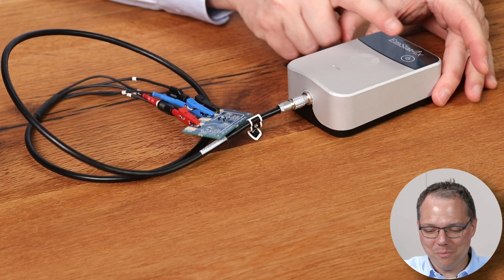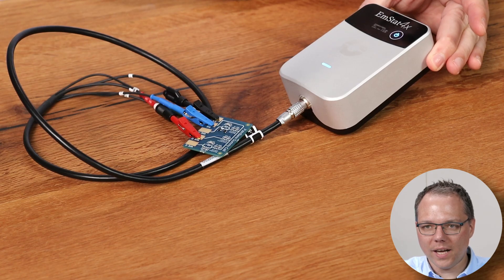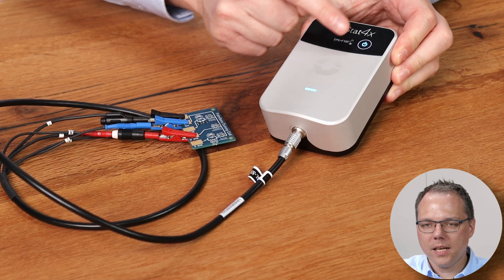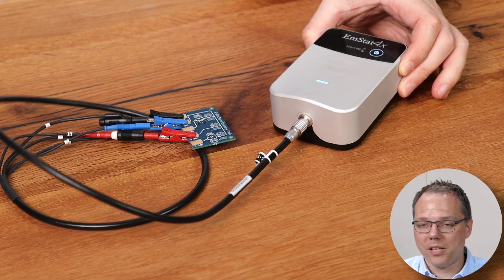Now I switch on the EmStat 4X by holding the button. To connect via Bluetooth in PS Trace, I need to know which device is mine. On the screen of the EmStat 4X you can find the device number, which you will then select in the Bluetooth menu.